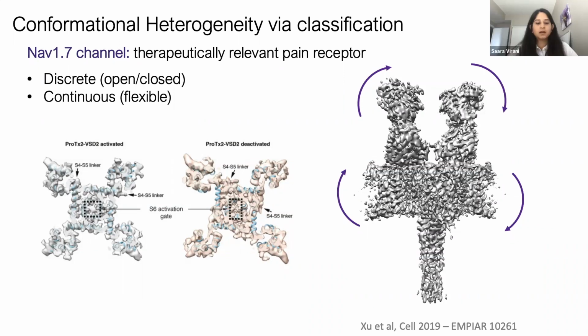Thanks. How should we actually go about working with the different, I believe there are different modes, right? So there are different modes implemented in the 3D variability analysis job. Should we start off with a simple mode, or is there a particular approach? So the different modes, they're actually in the 3D variability analysis display job that helps you create the movies and other display items coming out after 3D variability analysis.